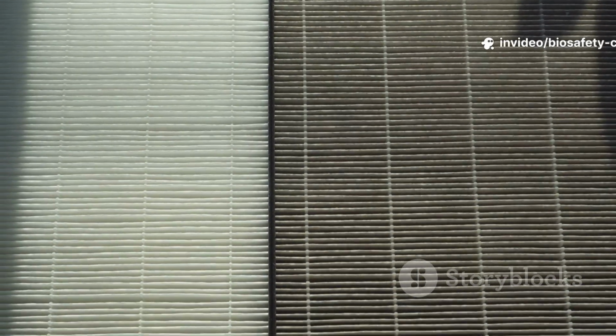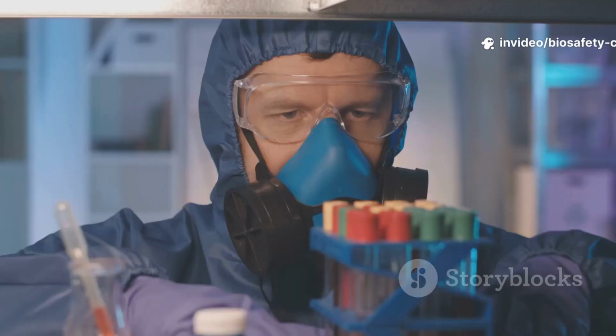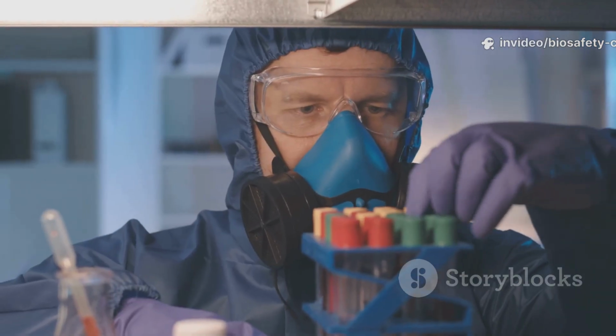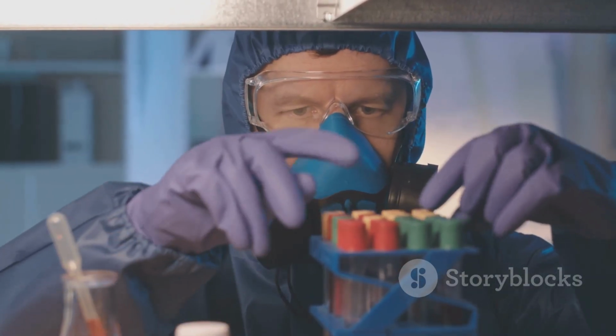The magic of Class 2 cabinets is in the HEPA-filtered downflow air, which keeps your samples clean, while inflow and exhaust protect you and the environment. You'll find these in clinical, diagnostic, and research labs, especially when working with human samples or infectious materials.